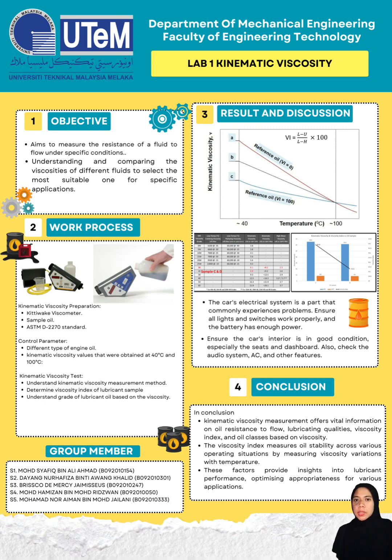First of all, my name is Nurhafiza binti Awang Khalid. We'll explain the objective of this lab. The objective of the kinematic viscosity lab is to measure the resistance of a fluid to flow under specific conditions, and also to understand and compare the viscosities of different fluids to select the most suitable one for a specific application.